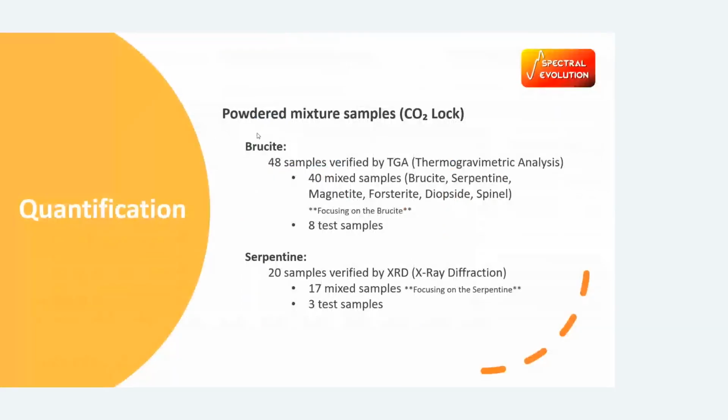All right, so we've talked about the identification part of it. Now let's move over to quantification. So the goal here was to take known concentrations of minerals, measure those samples with the ore expert, and then use our spectral data to create a quantification model.